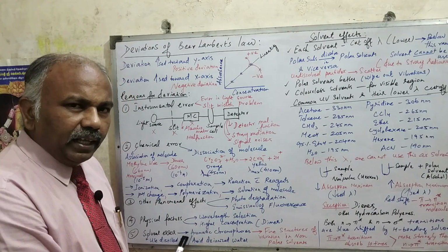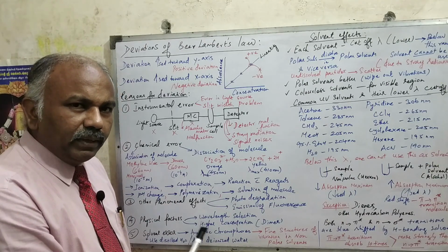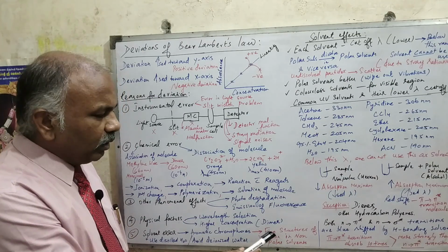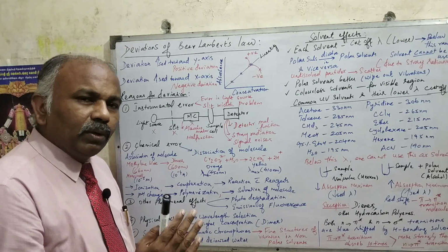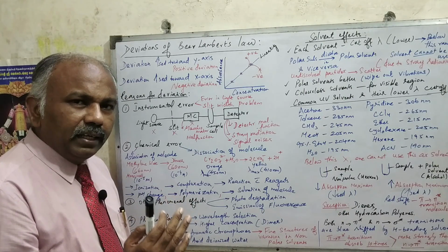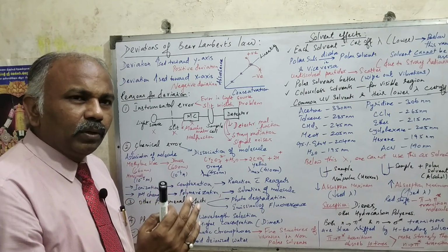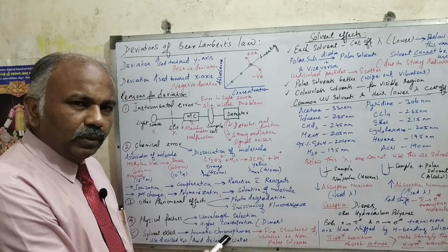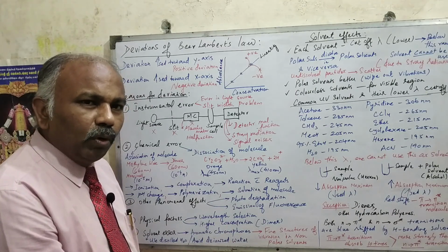Coming to the solvent error, whenever we consider aromatic chromophores, most solvents, particularly non-polar ones, always give fine structures of vibration. So whenever you are using any aromatic molecule, always prefer organic polar solvents, which will reduce the vibrational pattern, and therefore you will get the proper spectra for your molecule. Otherwise, if you use non-polar solvents with aromatic chromophores, it is a disadvantage and it will lead to more and more solvent error.